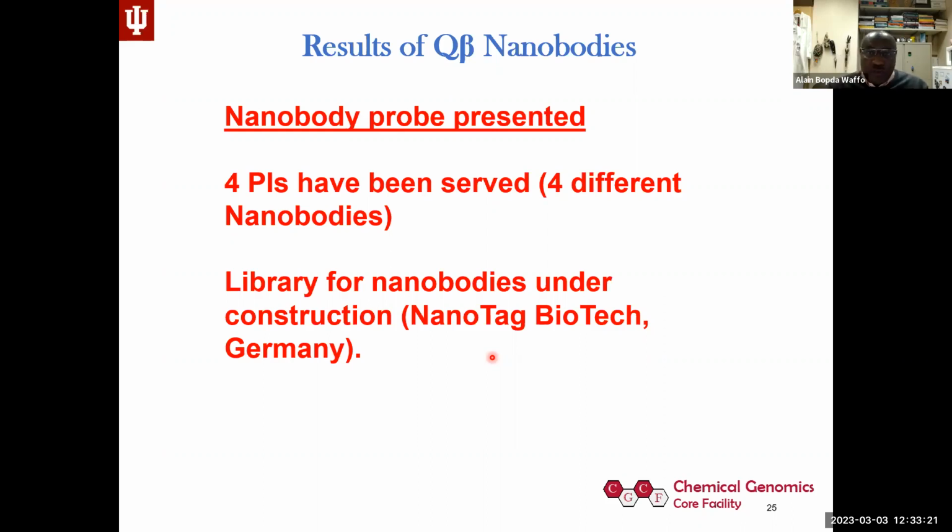We know it's a key. To really be sure that a target is druggable, we should be able to tell what the major interactions are, what the key amino acids are involved in probe and target. So that we can do. Because, like I said at the beginning, the advantage of the phage is that you have the genome, the genotype, and then you have the peptide on the surface, the phenotype. This link between genotype and phenotype is manipulable. We can just change this and see if the binding is still the same. Again, it's not that easy, but I'm just saying it's very possible.